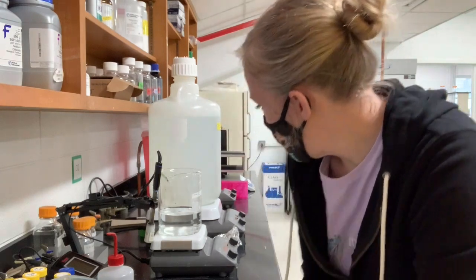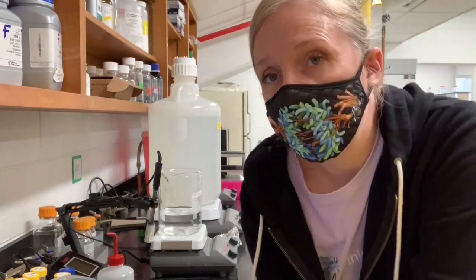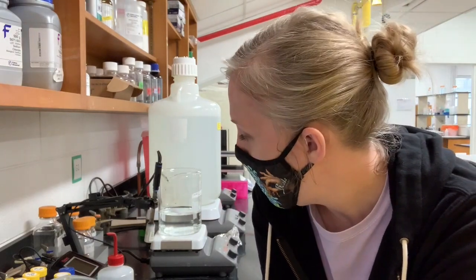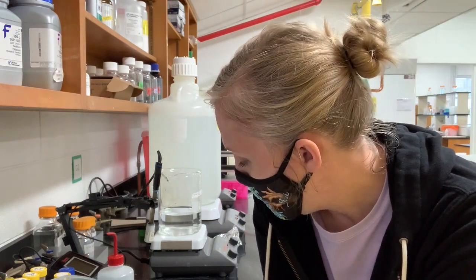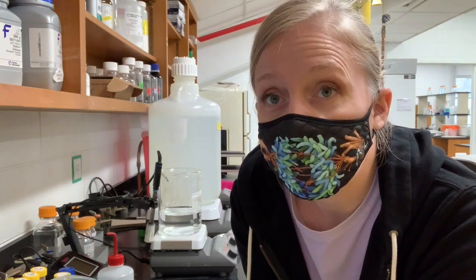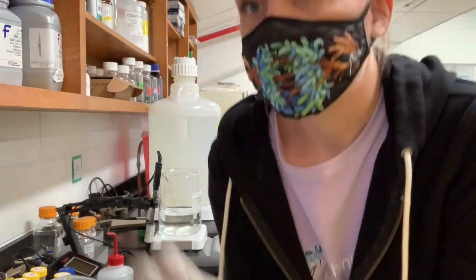So I'm going to allow this to spin, and I'll keep checking on it, and then we will come back and I'll show you how to pH the solution and how to bring it up to the final volume, and then how to treat it with a chemical called DEPC that will get rid of any RNases present.